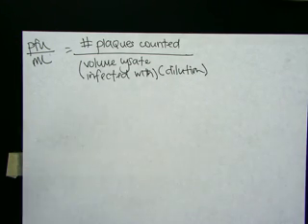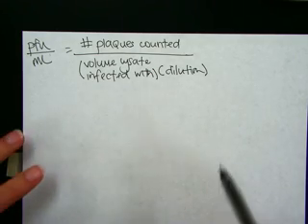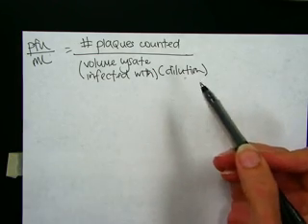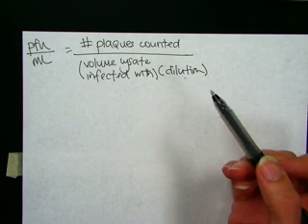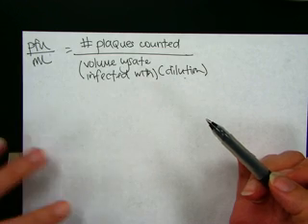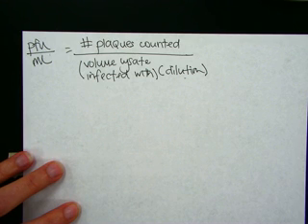So if you think about it, you have your tube of lysate, you're actually diluting it in two different ways before it infects the SMEG. The first and most obvious way is the serial or stepwise dilutions that you guys do, -1, -2, -3, like that. But the other way that you dilute it is by infecting with less than 1 milliliter.